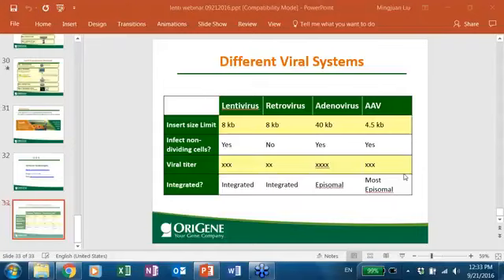Even if you have viral genes in the cell, it still cannot replicate because the deletion will be transferred to the 5' LTR, and that's the promoter for the virus to replicate. So it just will not replicate because there's a deletion in the 5' promoter region. I'm talking too detailed, I guess.